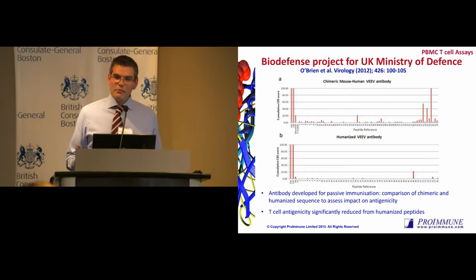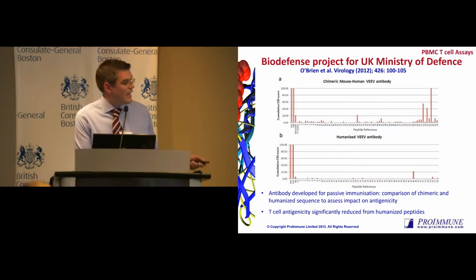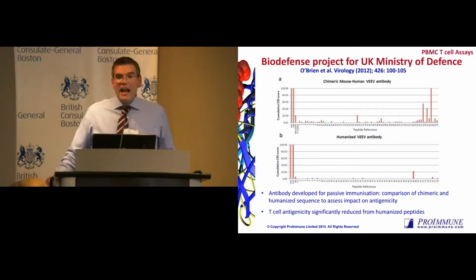But as we've seen from many of the other presenters today, there are many other factors which of course cause that immune response, notably the HLA restriction of the patients, the route of administration, aggregation of the molecule. There are so many other factors which come into play, whereas here we're just looking at synthetic peptide overlap. So all we can tell from this assay is really the importance of individual T-cell epitopes in that particular protein sequence, which is very valuable information from the point of view of the design of the molecule, but it doesn't tell you everything.